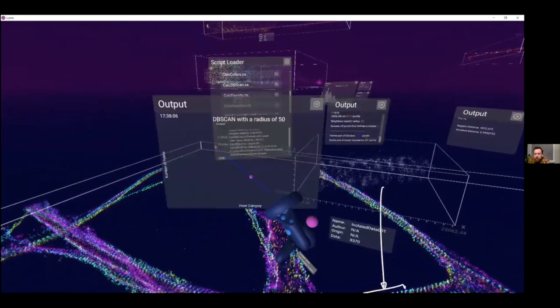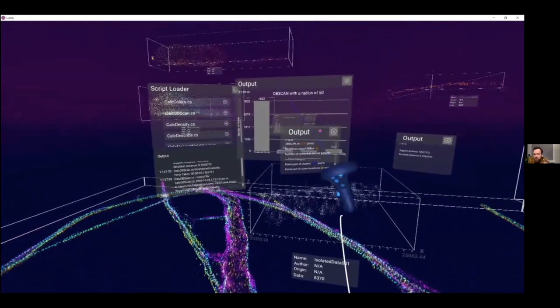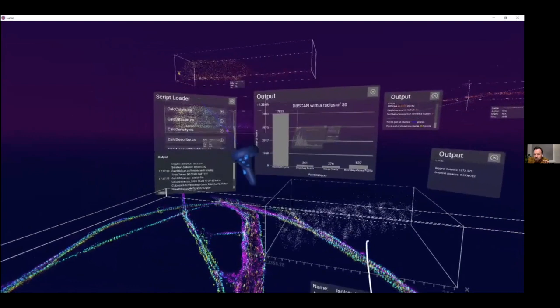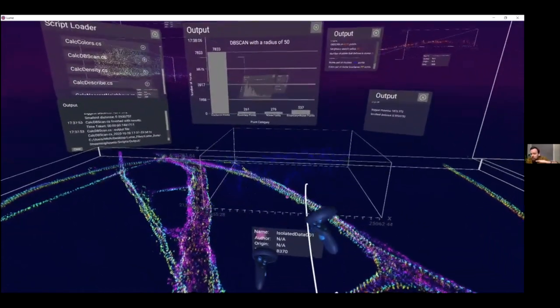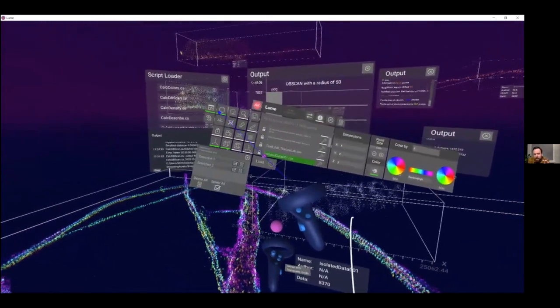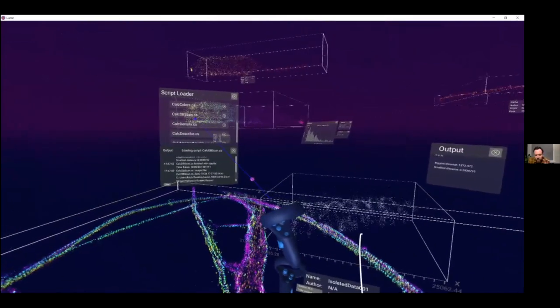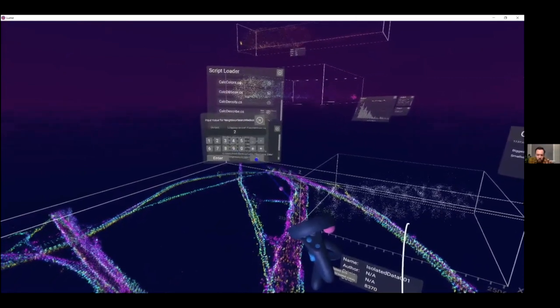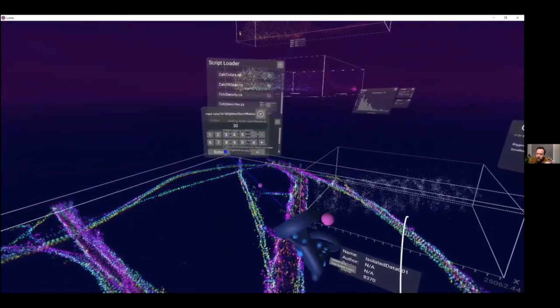So first off, biology occurs in 3 dimensions, even though the vast majority of microscopy images are 2 dimensions. So your confocal microscope might take a 3-dimensional picture, which is itself a series of 2-dimensional pictures that it maps together. This is actually taking a 3D picture and rendering it. It allows us to explore that data and really try and see it from different perspectives, and that kind of immersive nature of virtual reality and the ability to see it from different angles.